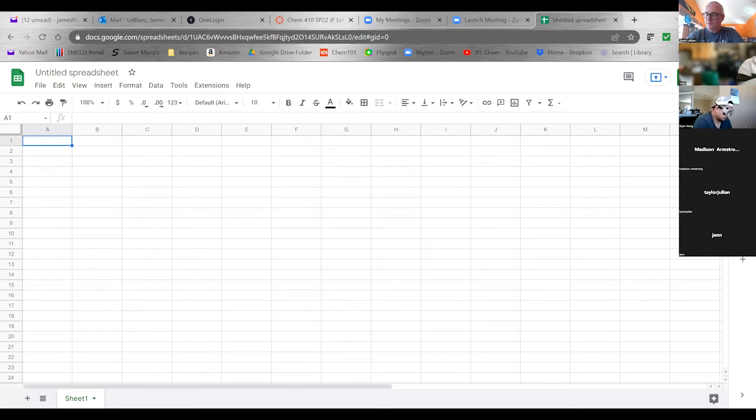As soon as it hits the surface, you stop the clock. Yeah, so I didn't realize that. There are so many different sizes of hole punches. Mine look pretty small, so I think mine are going to be faster than most people's. It sounded like a lot of you at 25%, they weren't moving at all, and I was getting times of less than a minute.